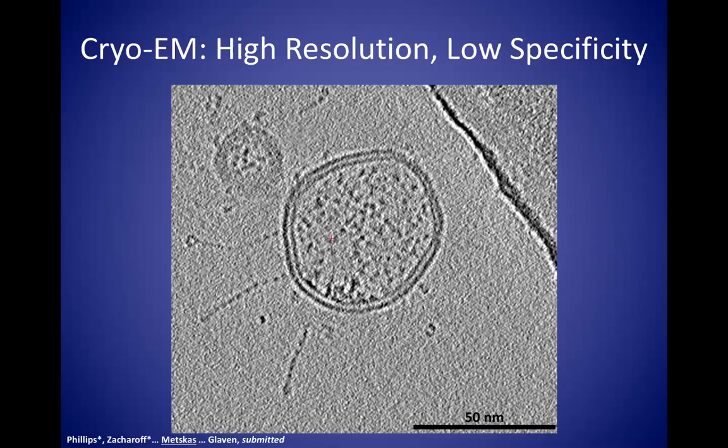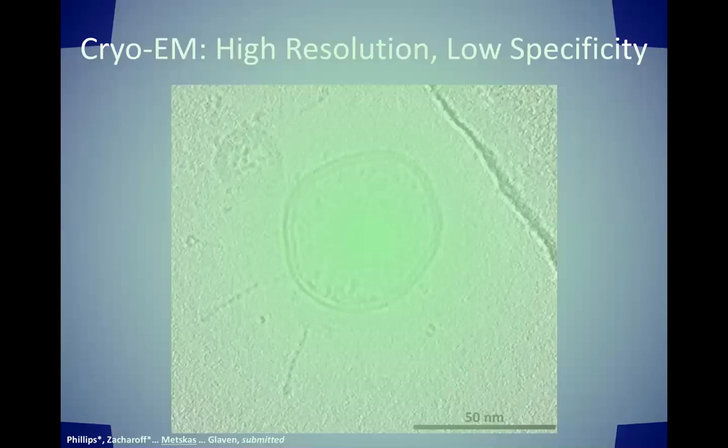Now, if I used cryo-CLEM today, it would look like this, because the resolution of the light microscope is poorer than the field of view that I'm showing you. And the precision of the correlation is lower than the diameter of this vesicle. So I could not even say if the protein was inside the vesicle, let alone use it to help me target it for subtomogram averaging.